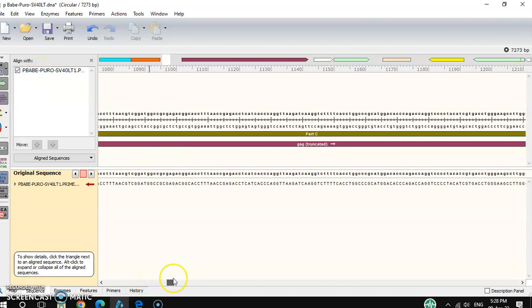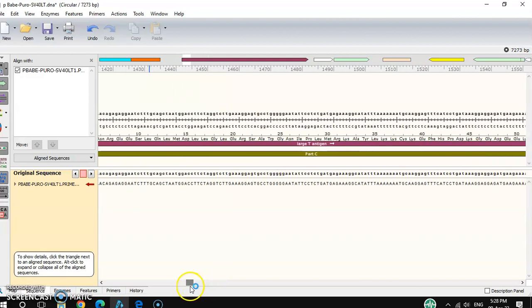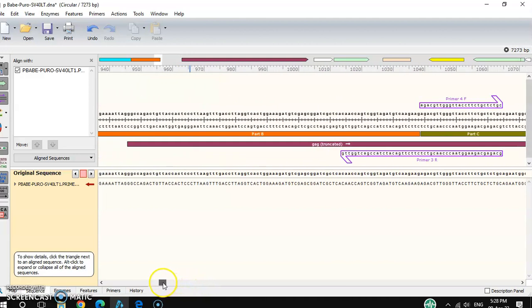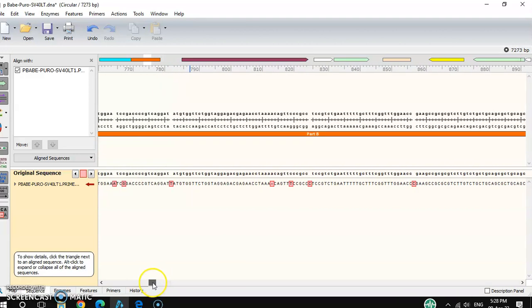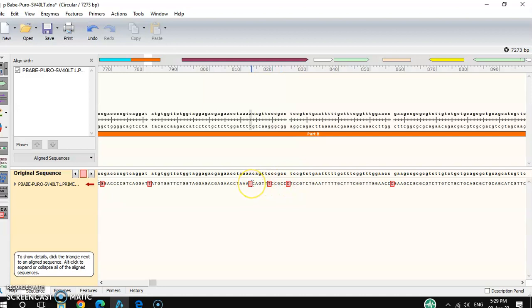You can see that most of this sequencing result aligns very well with the theoretical sequence, but not all parts are aligned properly. For example, in the theoretical sequence there is no C base pair at certain positions, but in your sequencing result there is one C base pair here and also another C base pair here — these are additional insertion mutations.